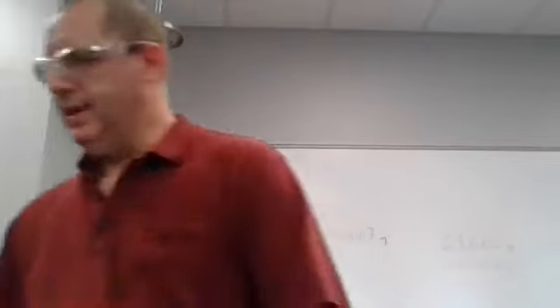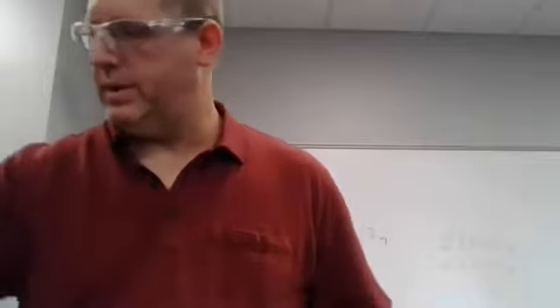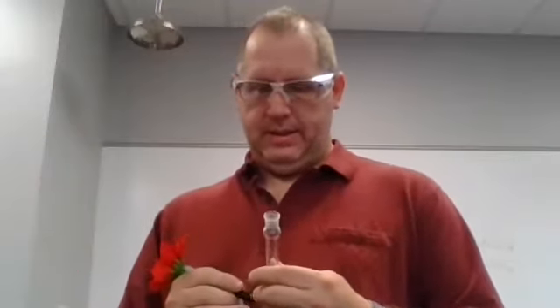You might recognize a little bit better technique this time. And in this one, I am going to label that again 10 parts per million of iron. As you can see that, I am going to dilute it with my solution. And I am going to be very precise on this. Okay, maybe not.